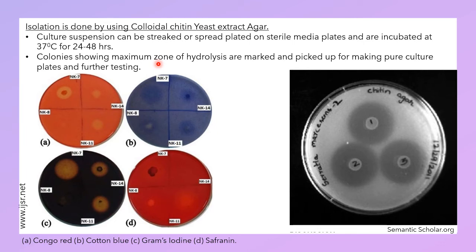Okay, so that is why you need to pick up your colony and you make your master plates.